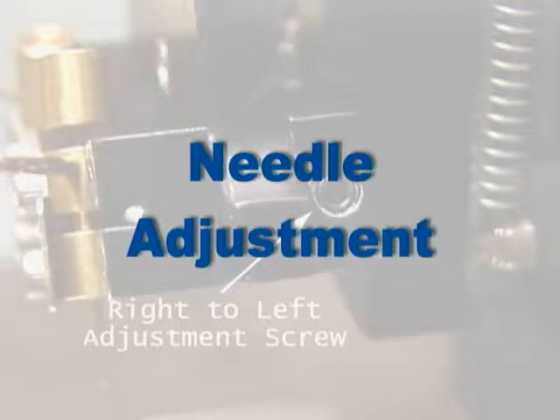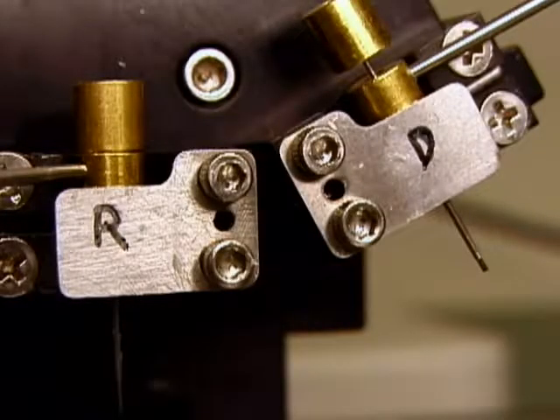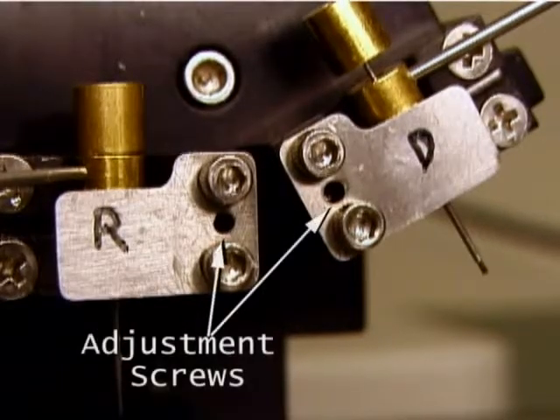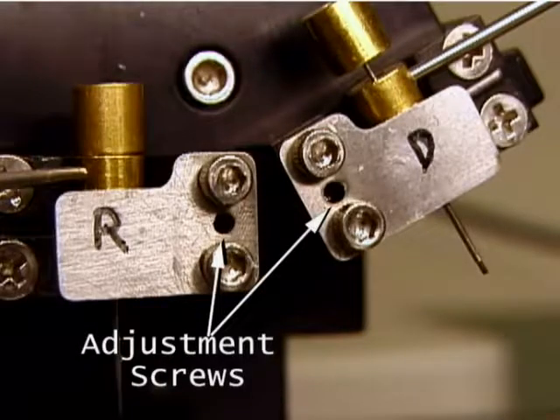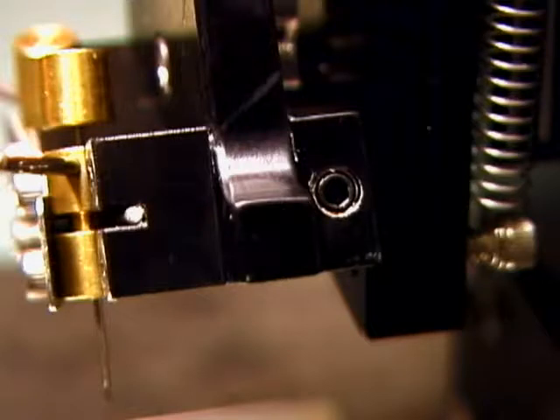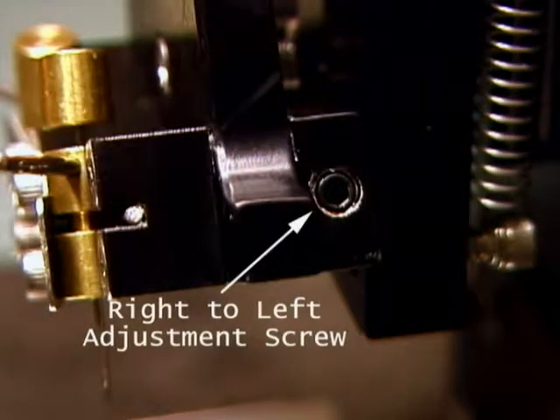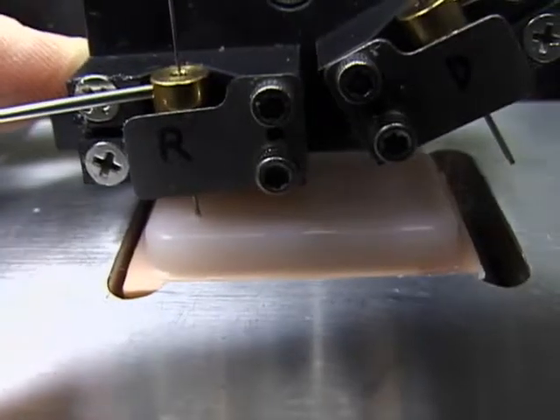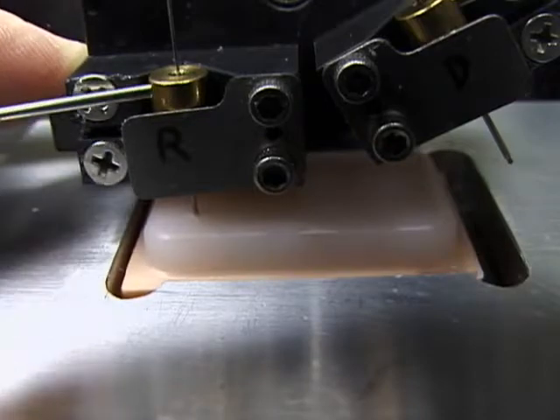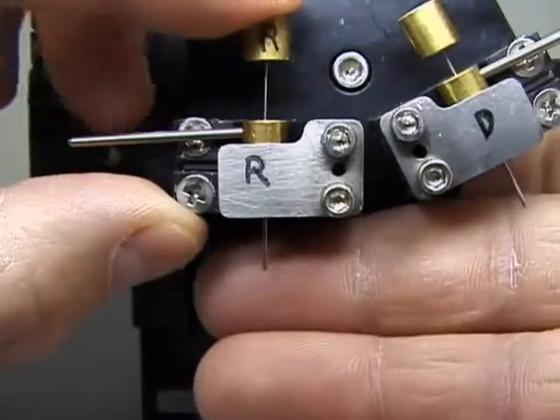There are two ways to adjust the needle, front to back and right to left. The front to back adjustment screw is in the small hole between the main screws on the front of the needle holder. And the adjustment screw for right to left movement is on each side of the turret. To begin adjustment, you will need to find out which way the needles are off. To do this, punch the recipient needle into a blank paraffin block.